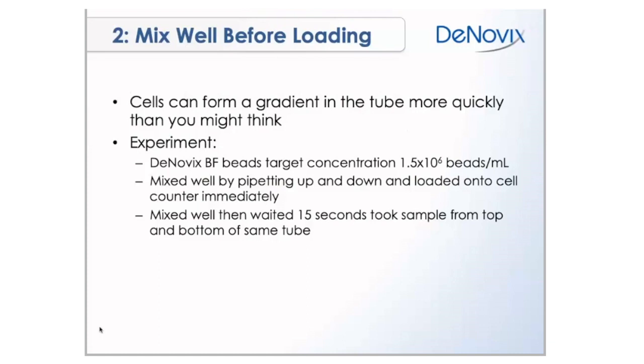A lot of people don't like to vortex their cells, which is understandable. So they like pipetting what's in the tube up and down a half dozen times before they load their sample. So that's the recommended way to do it. If you wait, you'd just be surprised how quickly the cells can settle to the bottom of the tube.